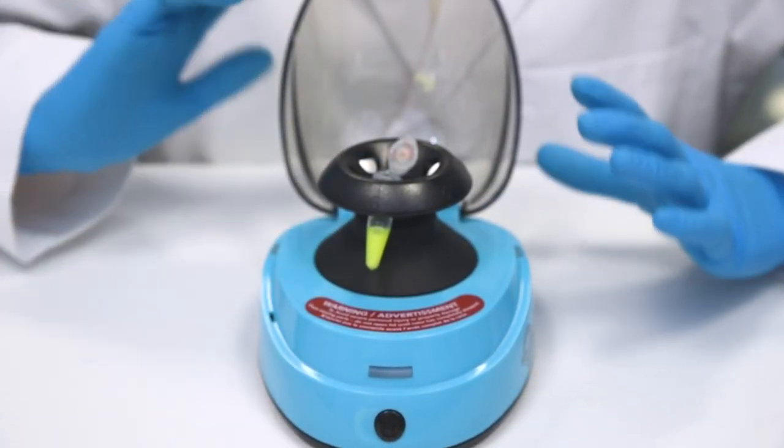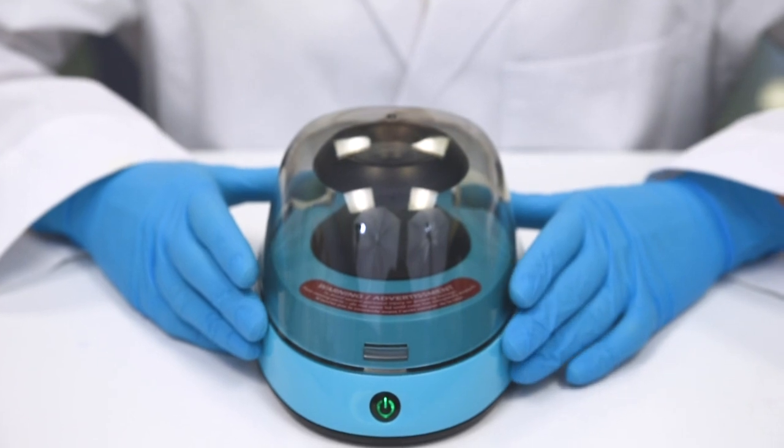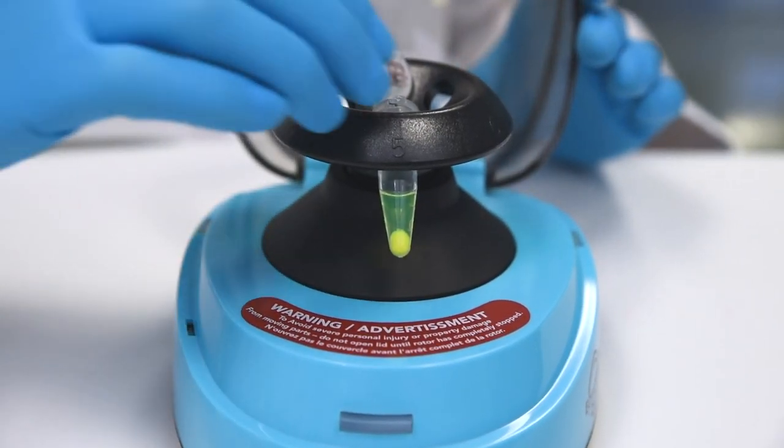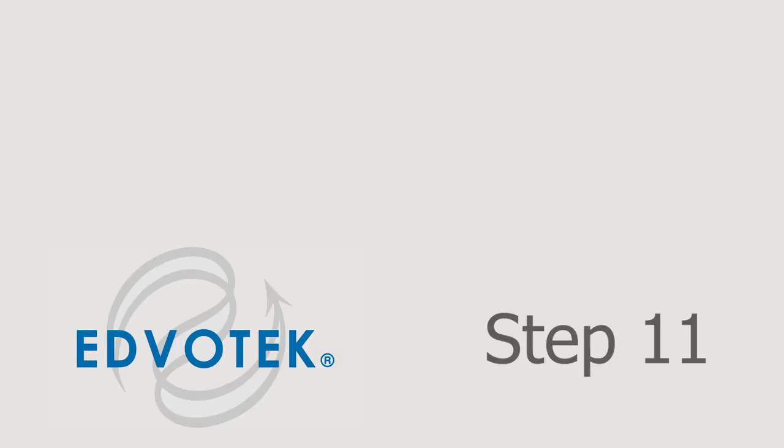Step 10: Centrifuge the tube in a microcentrifuge for 10 minutes at maximum speed. Make sure you have balanced your tube before starting the microcentrifuge.